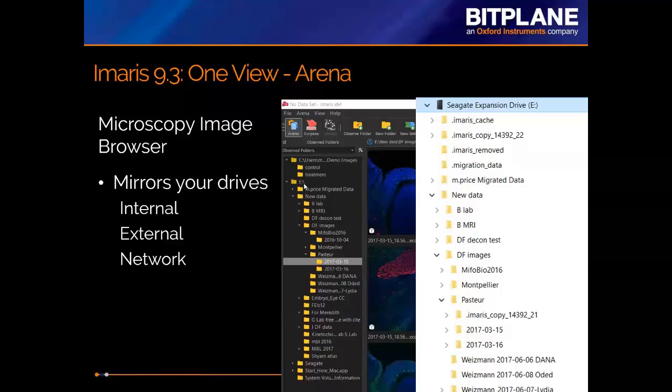This is a difference compared to how we did things in the past, and from talking to lots of customers, we found that there were frustrations there. We wanted to solve those frustrations, and based on the initial feedback that we've gotten, we think everyone will be very happy with how we're doing things now. Okay. So that's one important part, this mirroring.